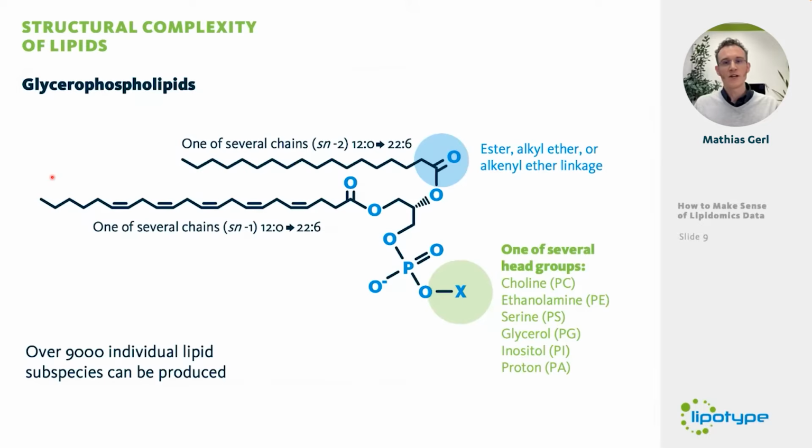These are complex lipids we analyze, and they are a structurally heterogeneous group of molecules which are composed of multiple parts. Here you have an example of a glycerophospholipid, which has a glycerol as a backbone with a phosphate, and it also has a head group. These head groups can be many, like cholines or serines or glycerols. Furthermore, you have two other positions that can be filled with fatty acids. These can be from, let's say, 12 to 22 carbon atoms, with about 0 to 6 double bonds.